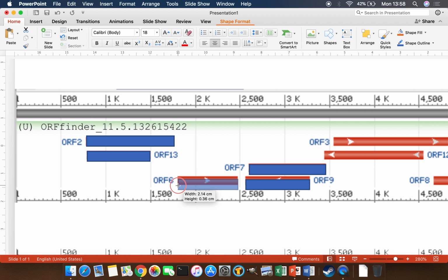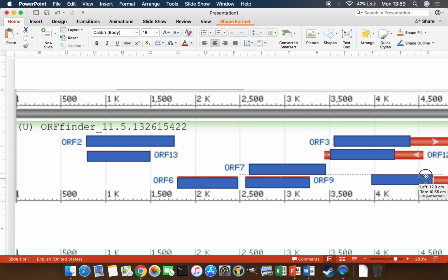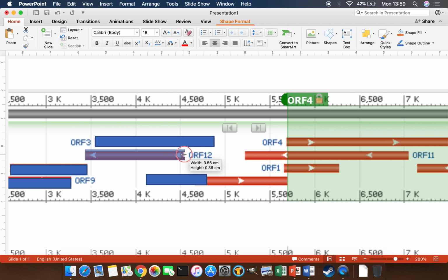And whatever's your favorite method of drawing, I don't know, is going to be fine. You could even theoretically make this thing on paper and then scan it in and then put it in your paper. That would be totally fine for this. I'm just a little faster on PowerPoint than I am by hand, and so that's the way I'm going to do it. Okay, we'll use that for number 8 over there. Here, let's move over. And I think our first end was right on this, and there's our second end. And let's get this guy on. Great. Etc. Okay, and so you see how it's done, and you just keep doing this for the rest of it.